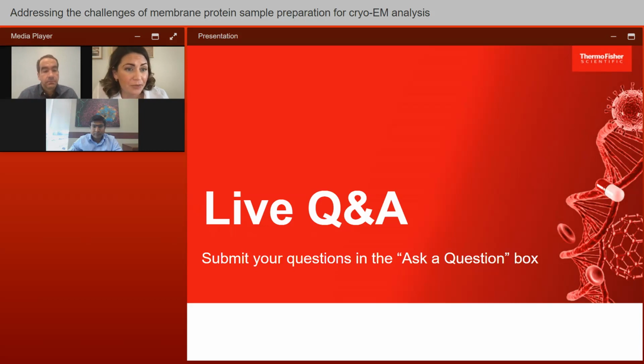Yeah, so I didn't do that myself, but I think it's a great idea, because if you've got a good functional assay set up for your protein of interest, and you know how to read out different conformational states or substrate binding or inhibitor binding, then I think that's a great place to start to see if you can whittle out those ones that are going to bind to your substrate binding site before actually putting them on a grid. I think that's a great idea.